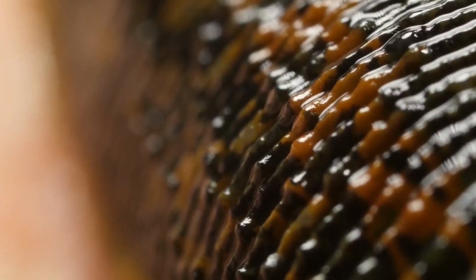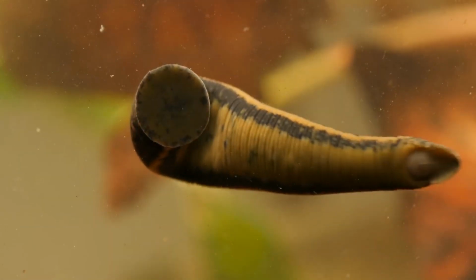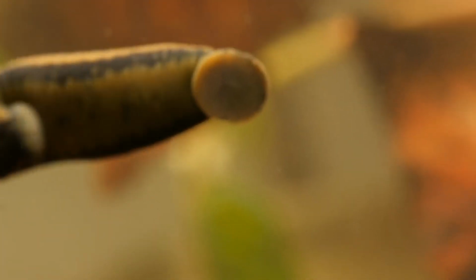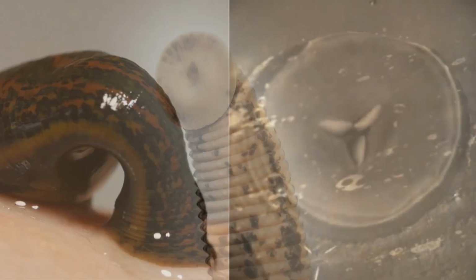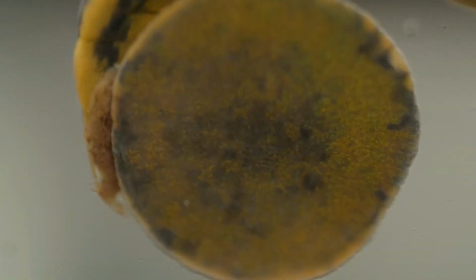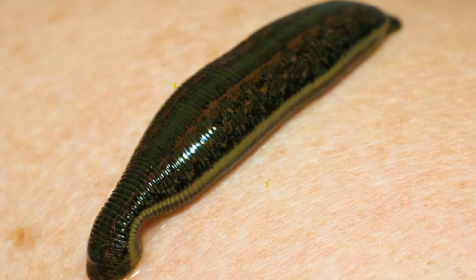Body surface always remains moist due to secretion of mucus from the body wall. At the anterior end on the ventral surface, a cup-shaped anterior sucker is present. Mouth is present in the center of the anterior sucker. A ventral sucker is also present at the posterior end of the body. Hundreds of arranged grooves or annuli are present on the body surface.